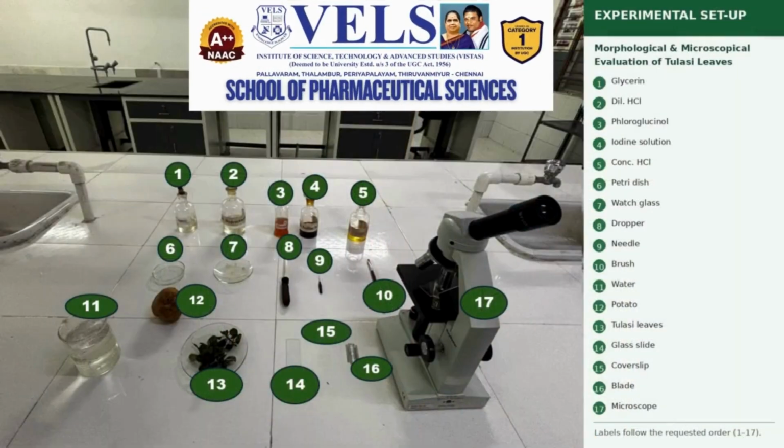Before beginning the microscopic evaluation, let us identify the experimental materials required. The setup includes the Tulsi leaves, glass slides, cover slips, a blade, needle, brush and dropper, watch glass, petri dishes, water, glycerin, dilute hydrochloric acid, iodine, concentrated hydrochloric acid, and phloroglucinol, along with the microscope for observation.